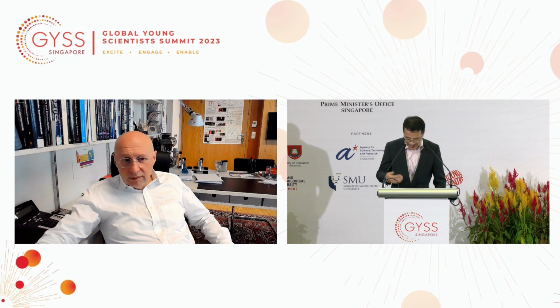Thank you. Okay, Professor Stefan Hell, we also have many online participants and they raise many interesting questions. So let me just flash one question to you. What do you think the next step is? Will it be possible someday to achieve a laser or light focus of 1 nanometer or even smaller than that?